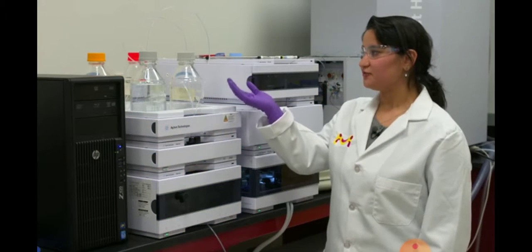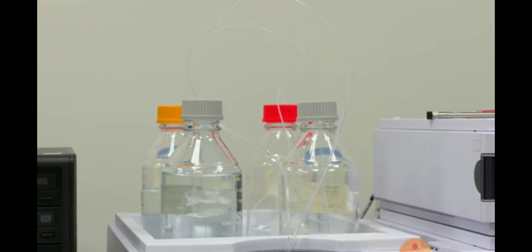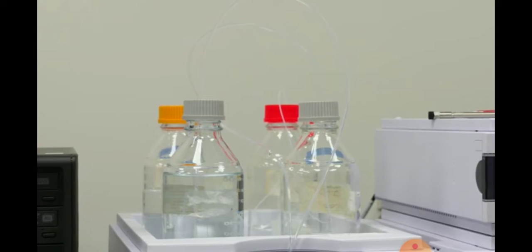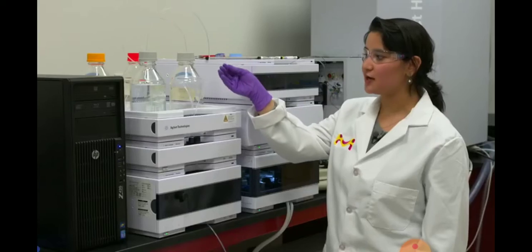Once your mobile phase is filtered, attach it to the appropriate mobile phase tubing line. And make sure your tubing lines are flushed into a waste container so it does not carry any carryovers that can cause contamination to your system.